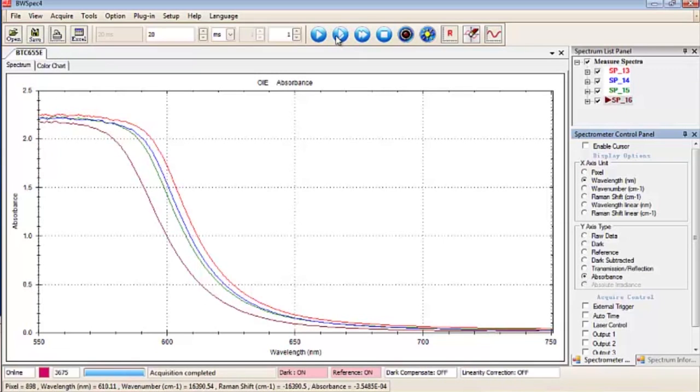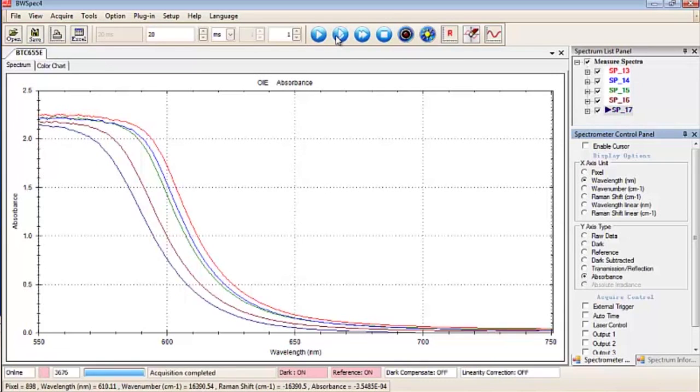And why do we have to take so many samples for this one? Well, one of the reasons is that if you have an unknown compound, what you can do is take all this data that we're measuring and export it to Excel and plot a calibration curve. So if you have an unknown concentration, from your calibration curve you can determine what concentration it is.